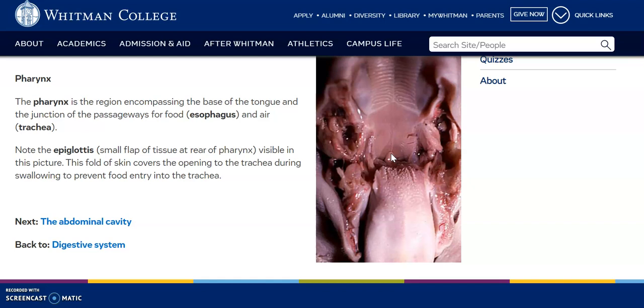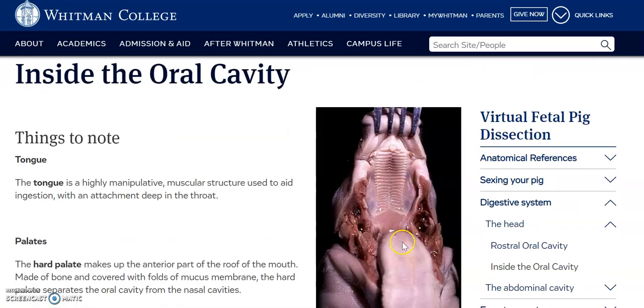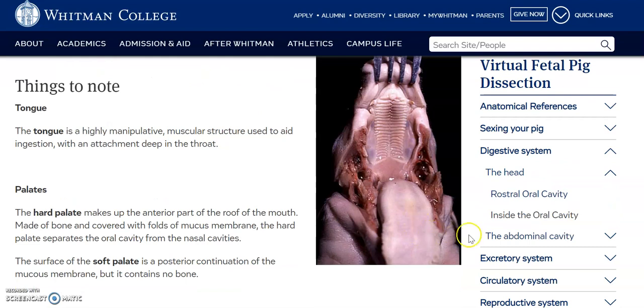Now, when you choke, what happens is normally you're laughing or talking or breathing in heavily, and that's when the epiglottis gets confused as to, wait, am I letting air in? Am I not? And so that's when food can get caught in there and you can choke. So that summarizes the mouth and the oral cavity for our digestion.